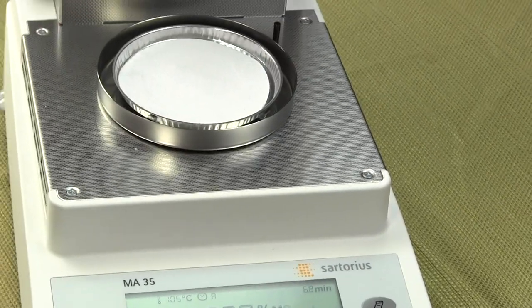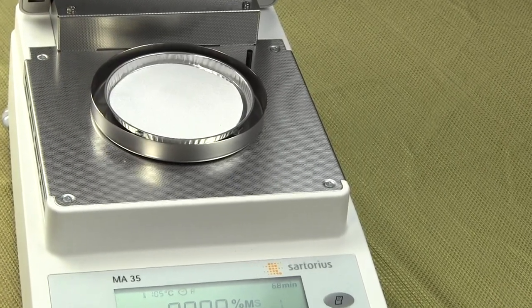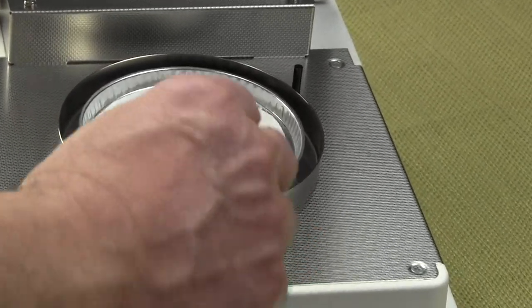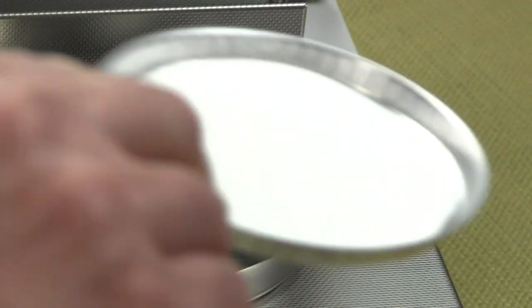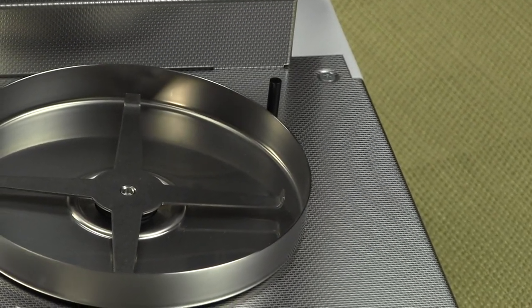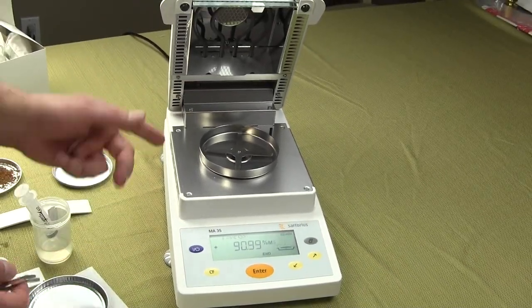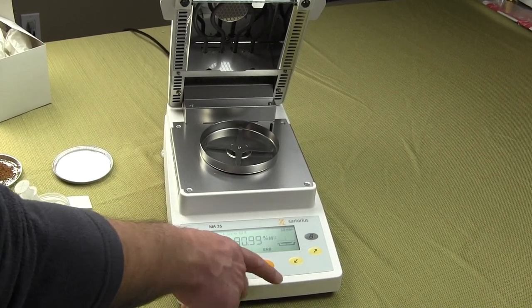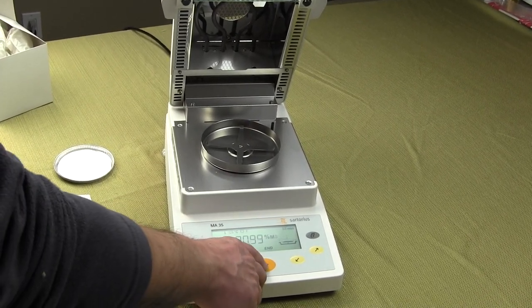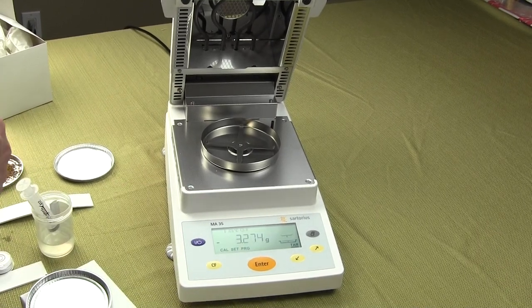To finish, simply open up the hood, use your tweezers, lift off the pan, and dispose of it. To run another test, just put on another moisture pan. When the test is done you can see your results. Hit enter to bring the balance back to the setup stage.